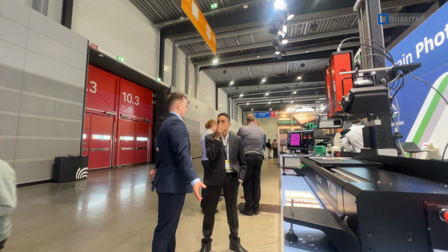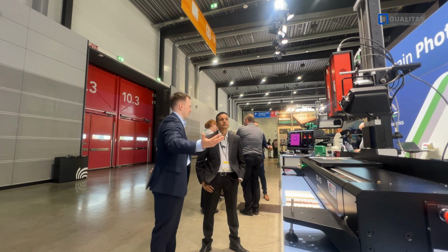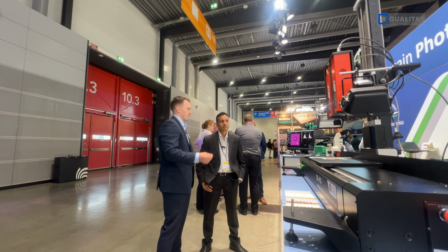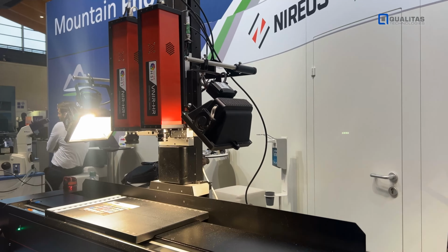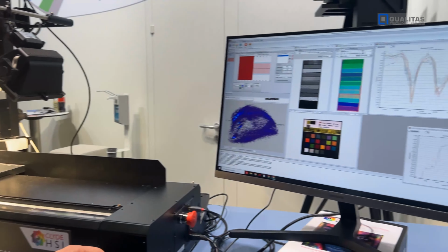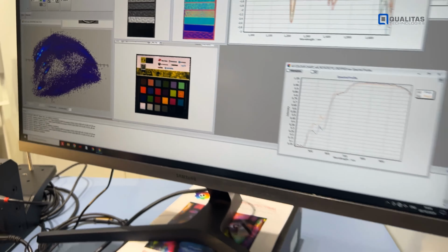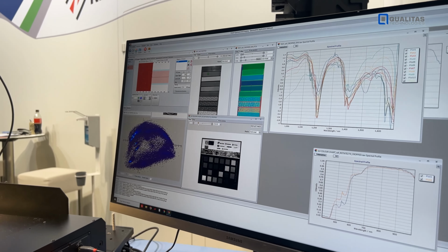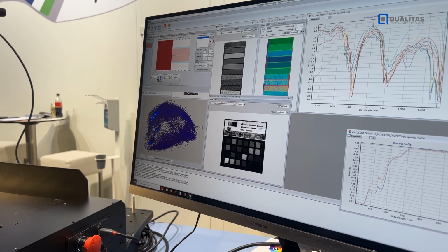But behind every single pixel, every point on that, you have 300 data points, or if you have 2 cameras, 600 data points, which gives you the ability to differentiate very closely related materials based on both color and chemical information. So we get a photorealistic image and we get spectral information. What that means is, if we have our data set, we can scroll through each individual wavelength image and visualize the image at that wavelength.